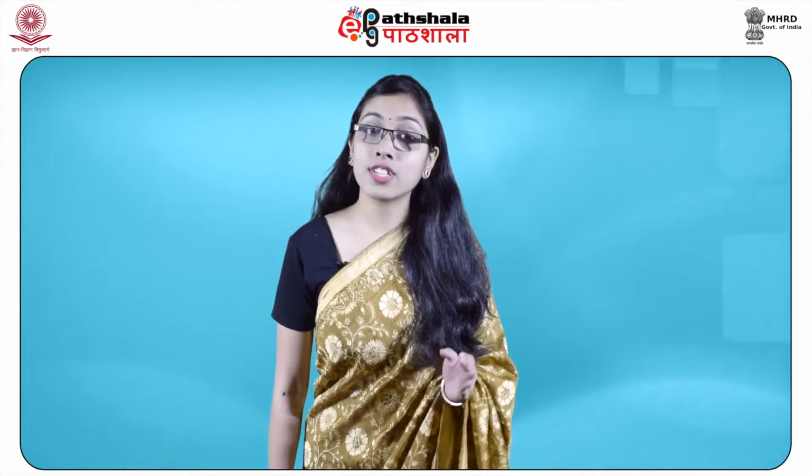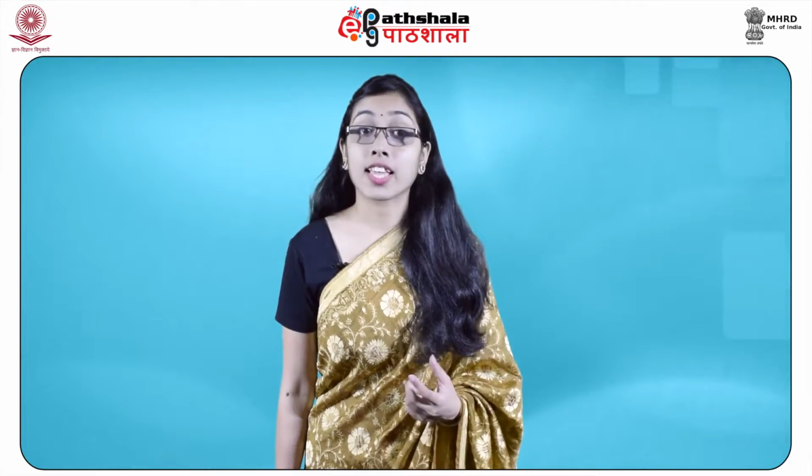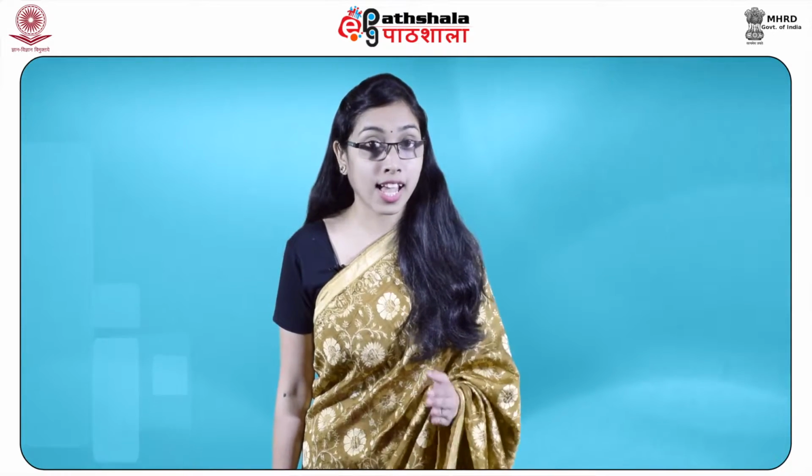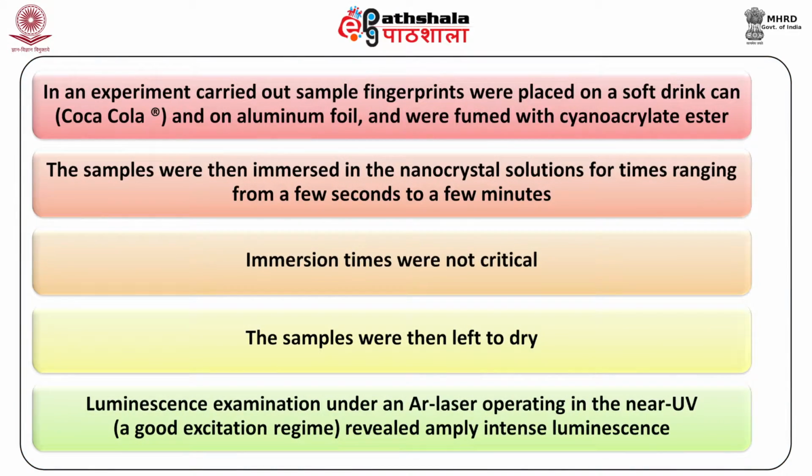Because staining with fluorescent dyes after cyanoacrylate ester fuming is a very successful fingerprint detection methodology, dioctyl sulfosuccinate-capped CdS nanocrystals dissolved in heptane or hexane can be employed in this manner. In an experiment, sample fingerprints were placed on a soft drink can and on aluminium foil, which were fumed with cyanoacrylate ester. The samples were then immersed in the nanocrystal solution for times ranging from a few seconds to a few minutes. The immersion times were not critical. The samples were then left to dry.